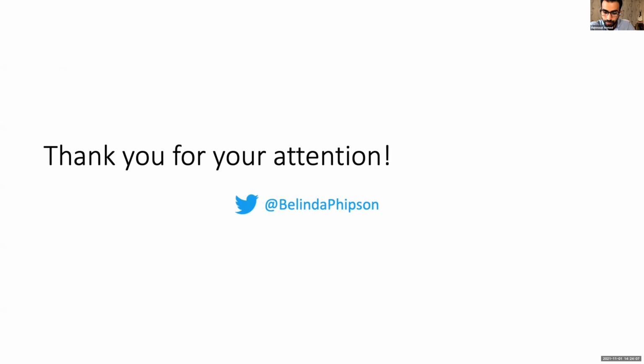Thank you, Belinda. If anybody has a question, please leave it in the Slack channel. I will start with a question from myself. What do you recommend regarding the feature that you just showed being added to the package, selecting the genomic features to limit the significance, in terms of the biological interpretation, or the biological cases of how to assign the CpGs to the genes in general, or only to specific features? What do you recommend for people to do, especially for the biological interpretation of each case?